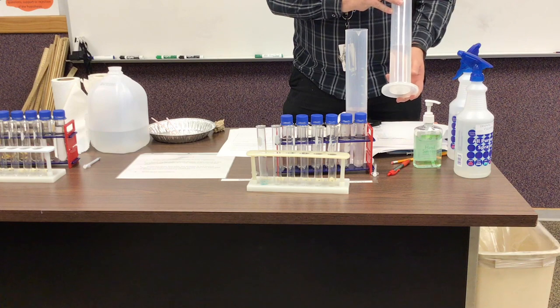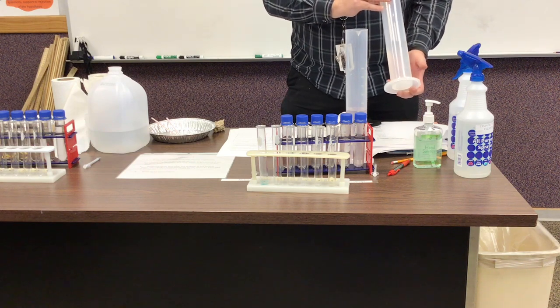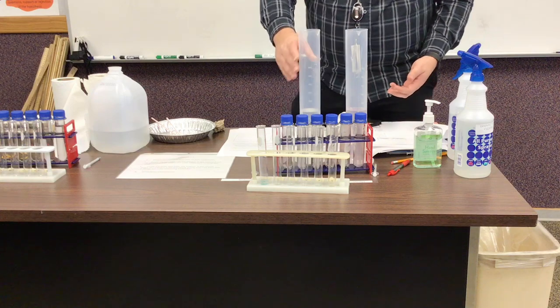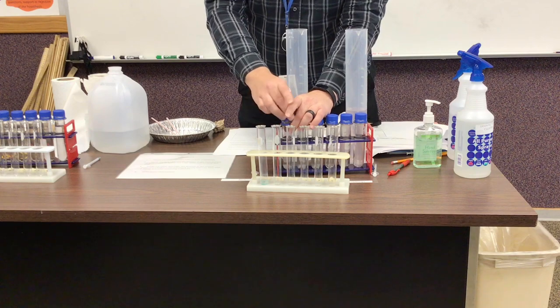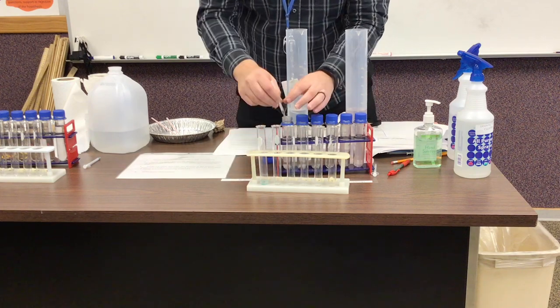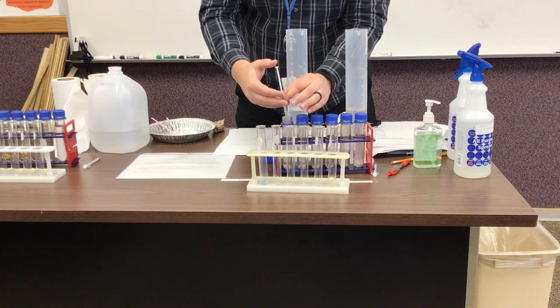Go ahead and record the physical state and the color of the ammonium hydroxide, and then we will do the experiment. We're going to take some of the ammonium hydroxide and put that in a test tube.